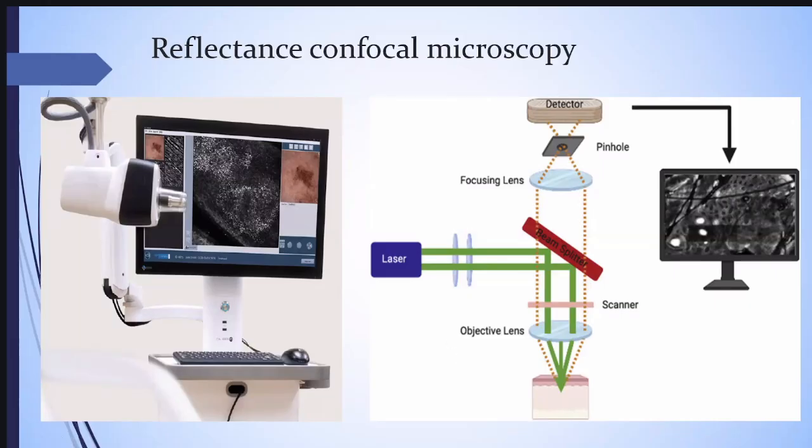And then slowly the spot is moved across the tissue at different points. It is completely done. It is just moved across the specimen to scan the whole area. And now the complete collection of these 2D images in different focal planes is made, right? So it's just along the focal plane alone, the light falls here, and then you get a 2D image of this. Now we have got a collection of 2D images. Now a 3D reconstruction is done there because at different planes you're going to do that 2D image. So you get a 3D reconstruction, and that is confocal microscopy.